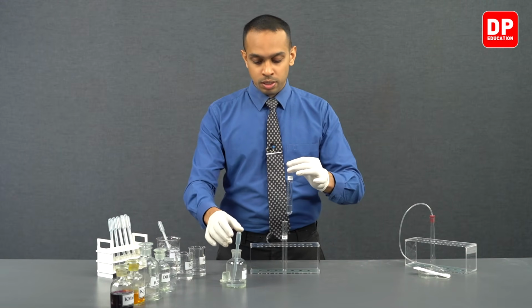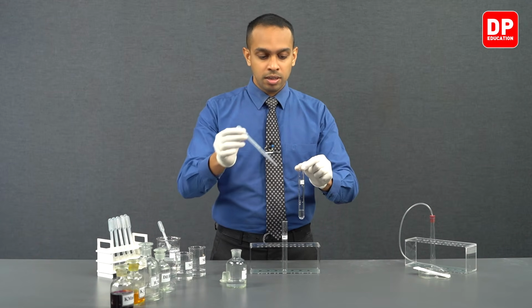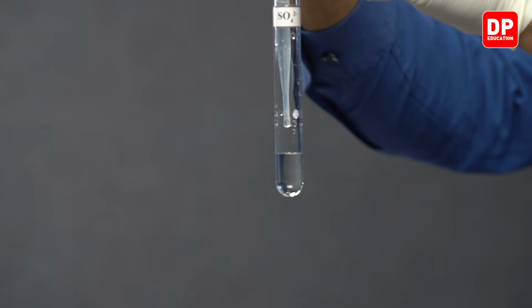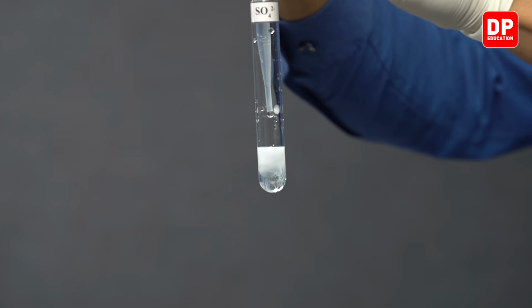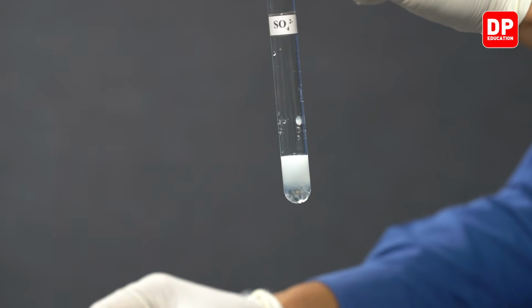So let's observe that. We have our sulfate ion solution, and to this sulfate ion solution, we are now going to add barium chloride. As you can see, when we add a few drops of barium chloride, we can very clearly see the formation of a white color precipitate.